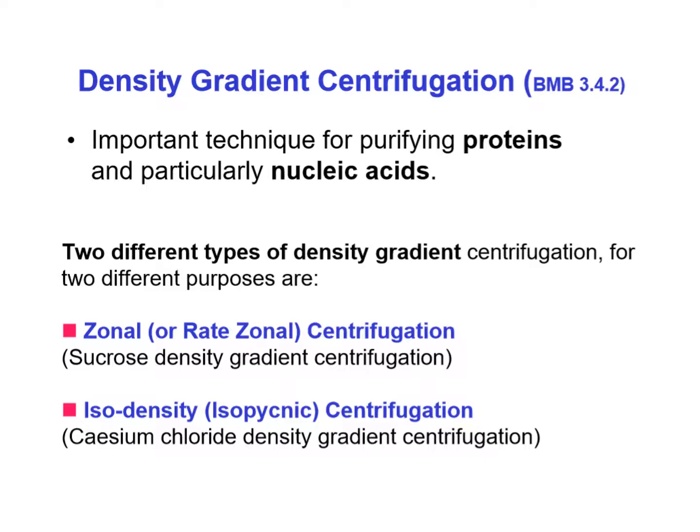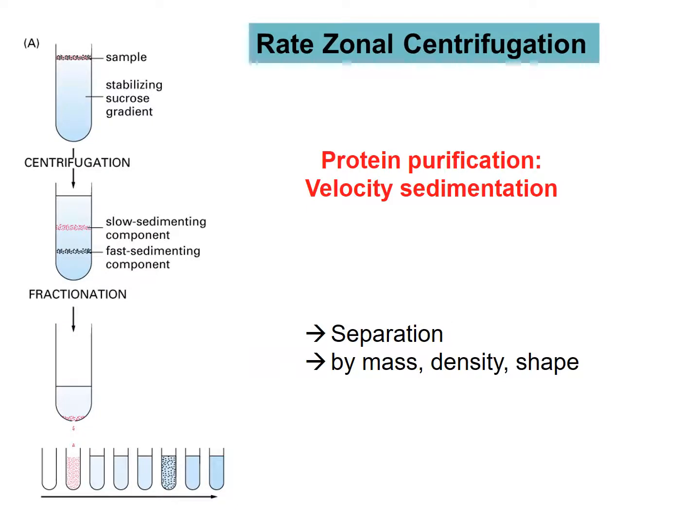So there's actually a media that the proteins, the organelles, the samples are in, and then there's two different techniques shown here in blue to use to move down the line. So you can catch this later here. We'll start off with rate zonal centrifugation.